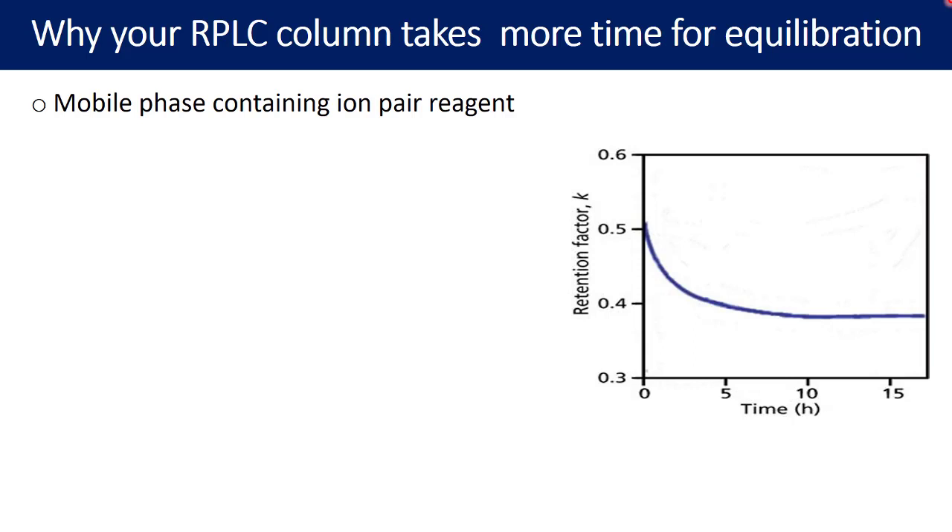How can one solve the challenge of longer equilibration due to the ion pairing reagent? Simply by avoiding the use of ion pairing reagents. To deal with shorter retention times for polar compounds instead, you can use polar stationary phases such as amine stationary phase, amide columns, or pentafluorophenyl stationary phase, which is quite good at retaining polar compounds. With these stationary phases, ion pair reagents are no longer required.